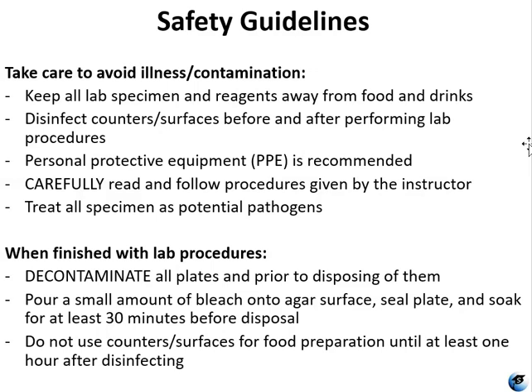You want to make sure that you carefully read through your procedures. These are posted onto Moodle. Don't forget to keep them nearby. Carefully read and follow those instructions. And treat all specimens as potential pathogens. Before you throw anything away in the trash, make sure you decontaminate your plates and seal up the plate before you throw it away. And I already talked about waiting for an hour after disinfecting the surface before using it for food preparation.